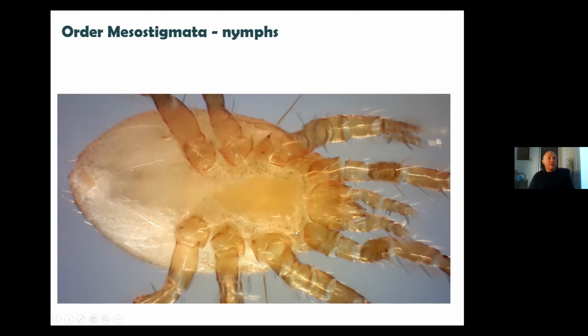If you see a lot of nymphs, you probably will not be able to get them to species unless it's by inference to other groups. This family key tends to abandon you when it comes to nymphs. Having said that, there are other keys published which do go to species, and they'll often key out the deutonymphs, the females, and the males as 3 separate groups. So it may be worth persisting, especially seeing as a lot of the creatures that you get phoretic mites on, beetles and bees and so on, are often in that deutonymph stage, and they're often pretty well described.